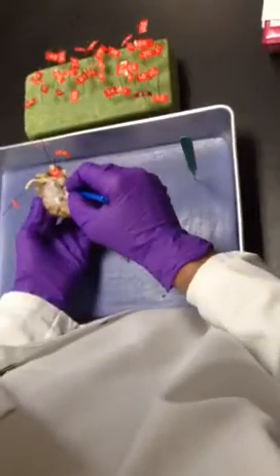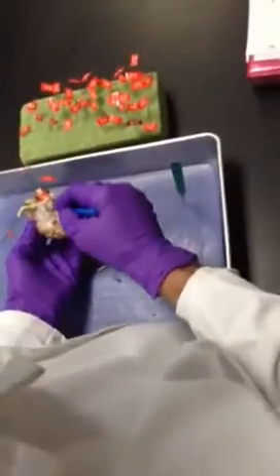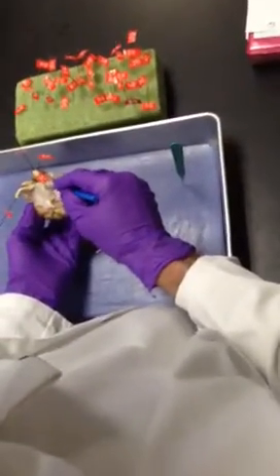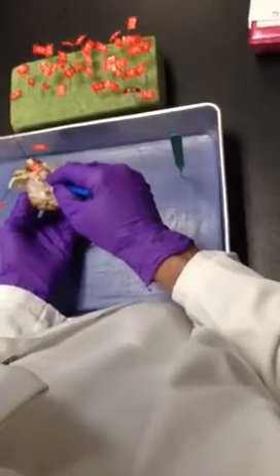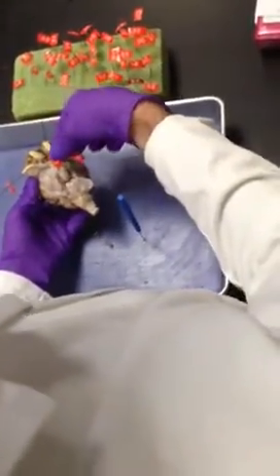Located between trigeminal nerve and your pituitary, all this stuff is just the vascular bed, all the blood flow that's going into pituitary. So all this dense material here is capillary beds.